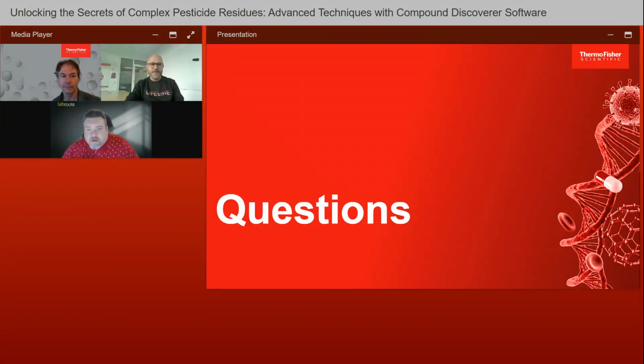Let's see here. Julio, we'll start with you. How does the sensitivity achieved by your method compare to the current sensitivity of the LC-HRMS?